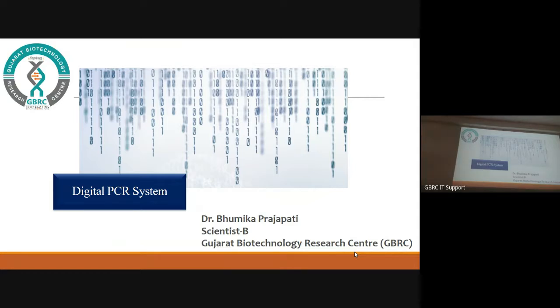Good afternoon, everyone. As discussed by Dr. Ramesh, the brief about the digital PCR. So, here we are discussing the principle, how digital PCR actually works, and what are the applications which can be performed by using the digital PCR.